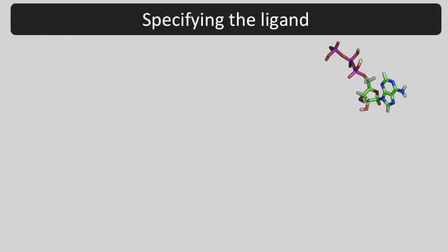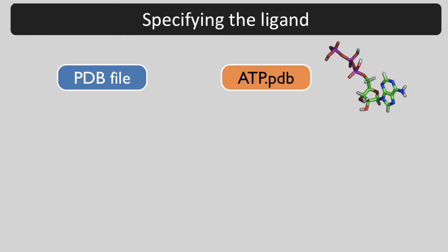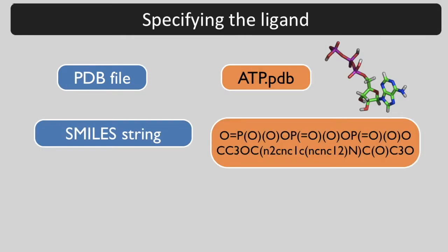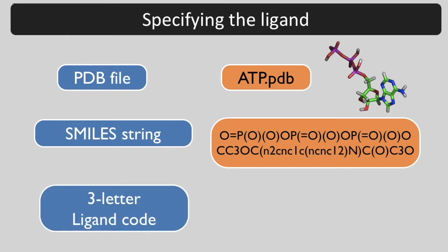You can specify the ligand in any of several ways: a PDB or CIF file with the ligand in it, a SMILES string corresponding to the ligand, or a three-letter code identifying the ligand.